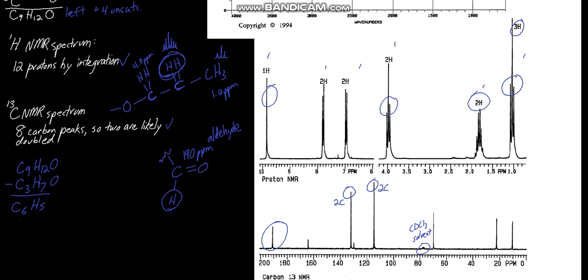That hydrogen can be subtracted, minus a hydrogen, leaves us with C6H4. And remember, we still have 4 unsaturations left to account for. And so those unsaturations are likely associated with the only signals we have left, and these are in the aromatic region. Could be alkenes, but most likely 7 to 8 ppm, aromatic ring, benzene type aromatic ring, very common in nature, is a good first guess.